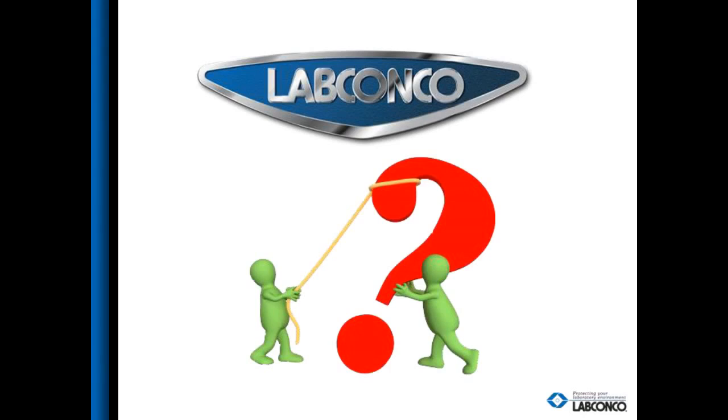Our first question is, we are in the process of planning a new lab. How can my team evaluate and calculate the ROI for a standard fume hood versus one of the high-performance hoods you talked about?